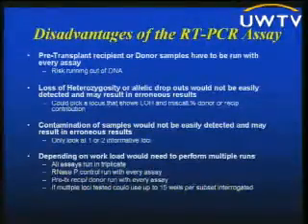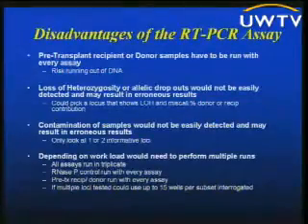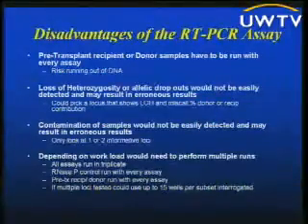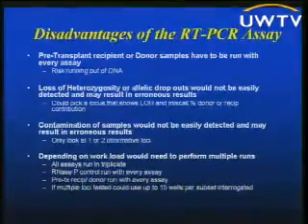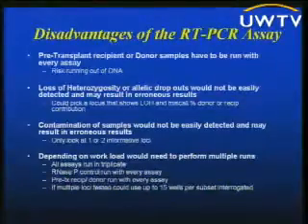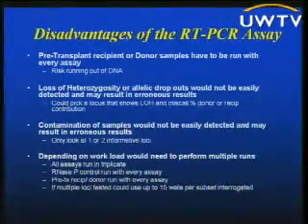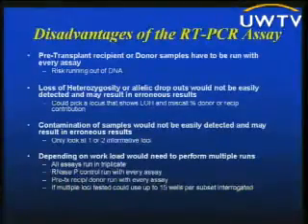Contamination, much as we would not like it to happen, does happen, even though it is fairly rare. With the STRs, it's very easily detectable, simply because you're looking at so many different loci. With this, if you're only looking at 1 or 2 informative loci, there's no way you'd pick up a contaminant, especially if it happened to be of the same flavor as what you're working with.